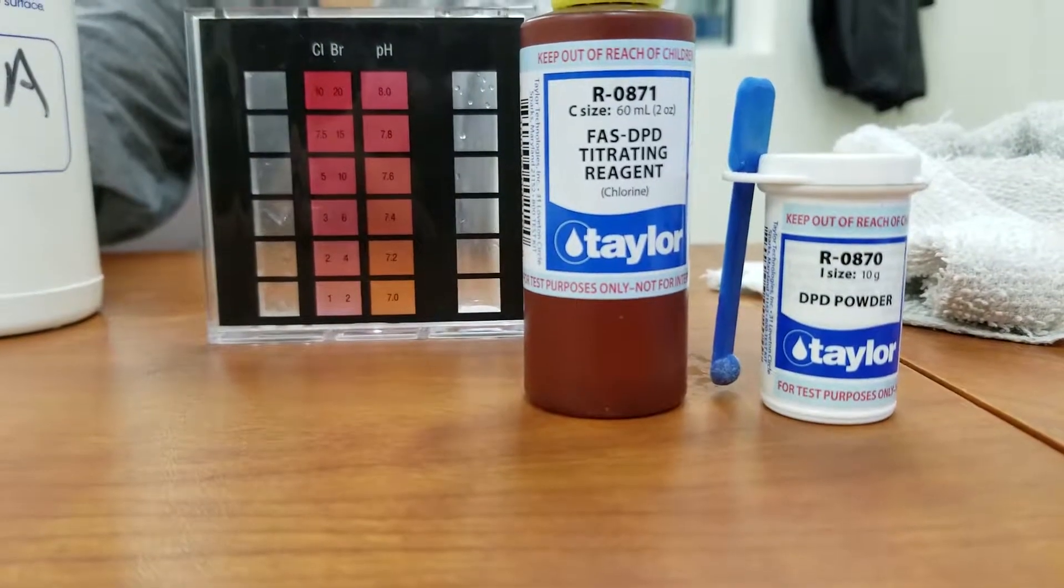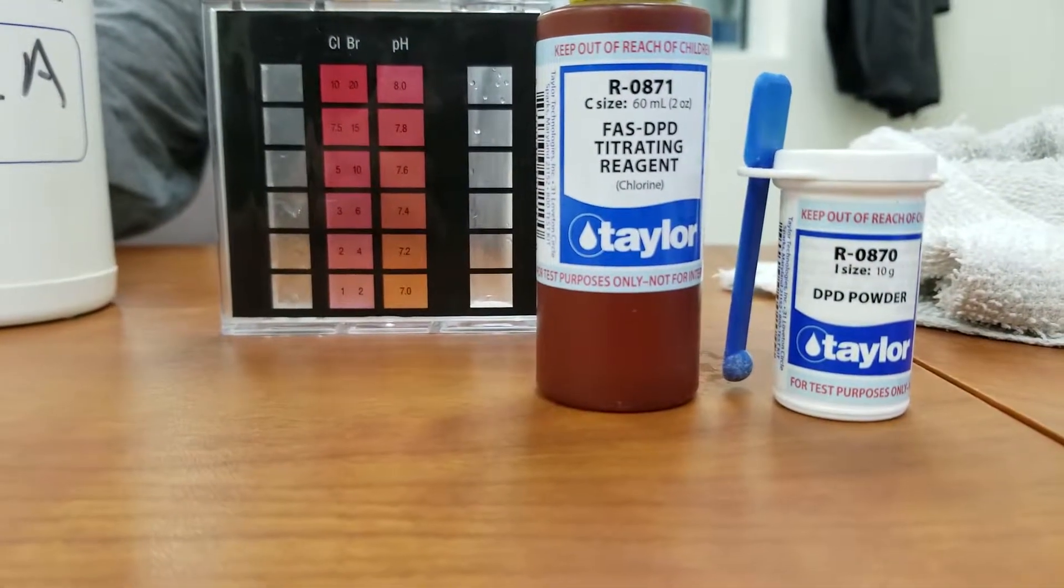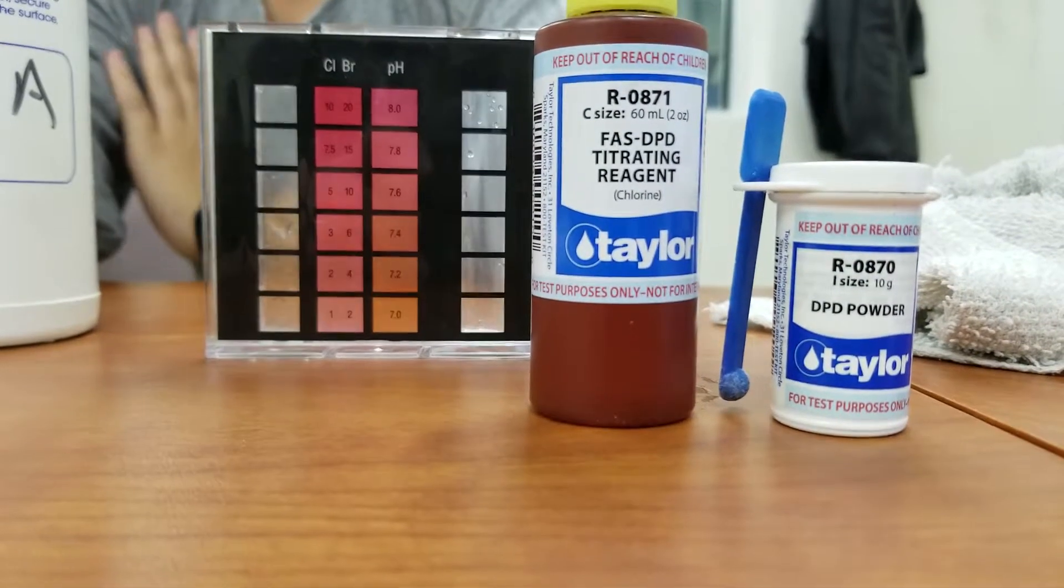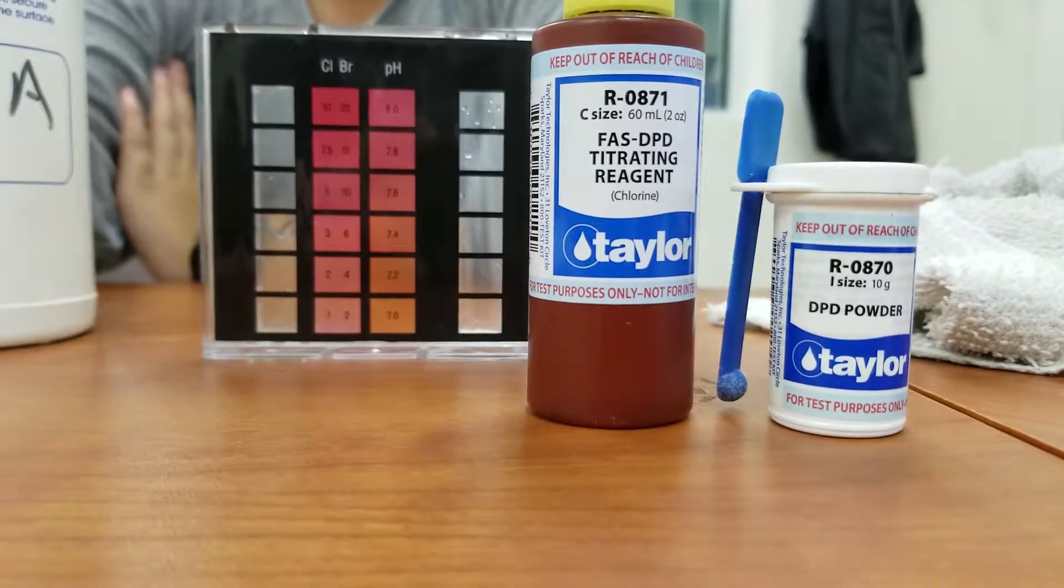This next test is going to be for our free chlorine using the FAS DPD. This is a titration, which is a lot easier to use than using our R001 and R002.